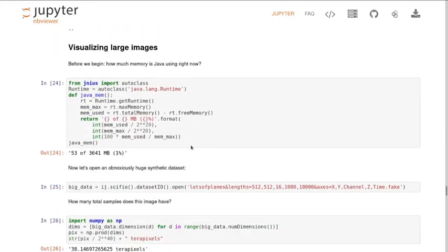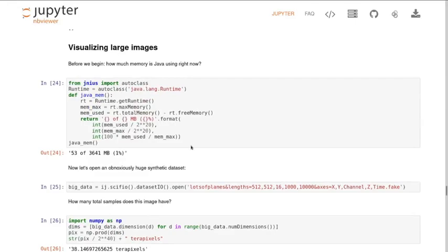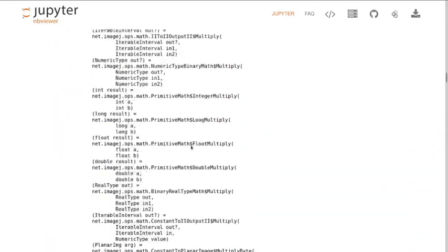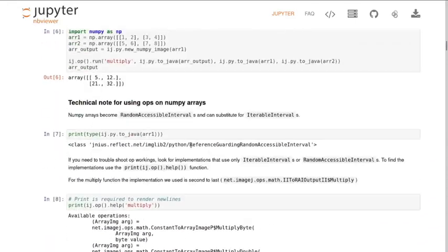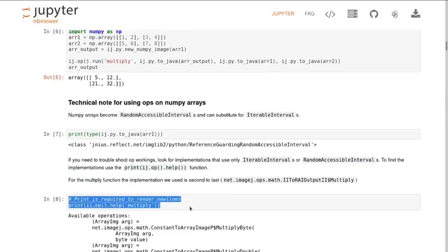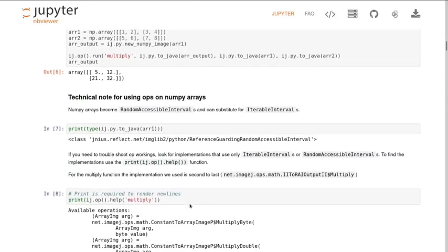So that's PyImageJ and that's probably going to become quite a useful library for migrating existing systems from Fiji and ImageJ into Python in the future.